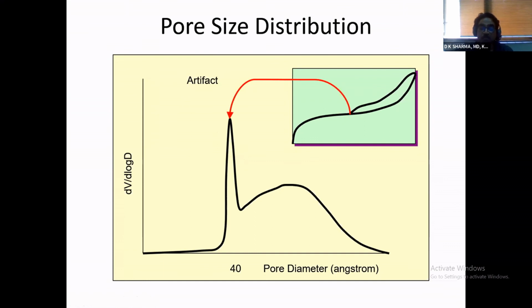Please be careful. It looks very beautiful. If somebody tells you my pore size is 40 and shows you this graph, it's a nice peak. You will say very good peak. It's a wrong peak, unfortunately.